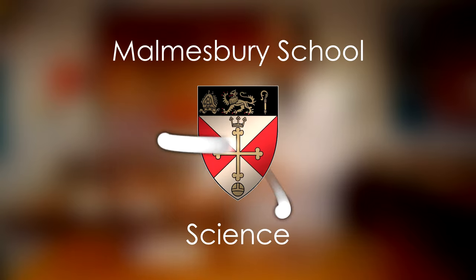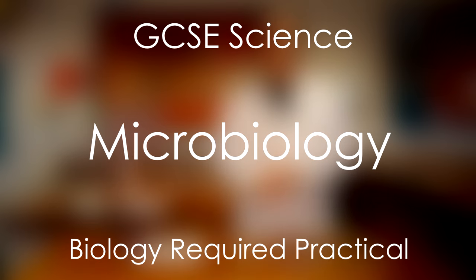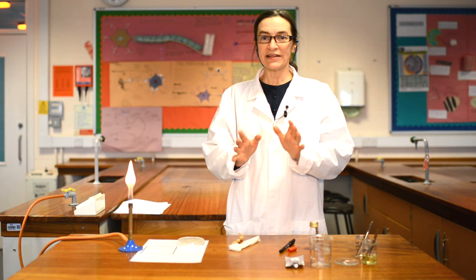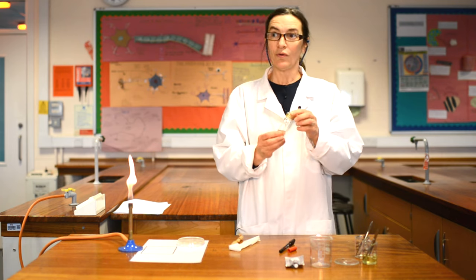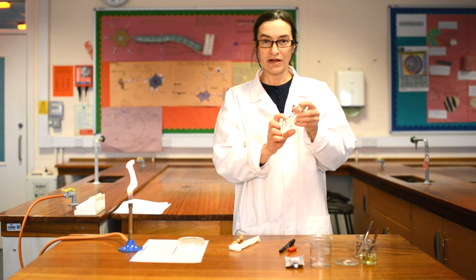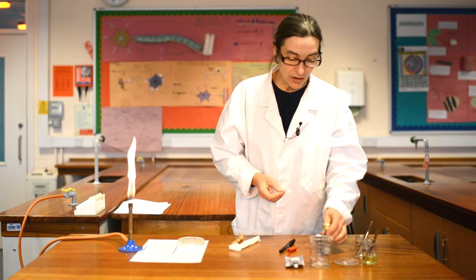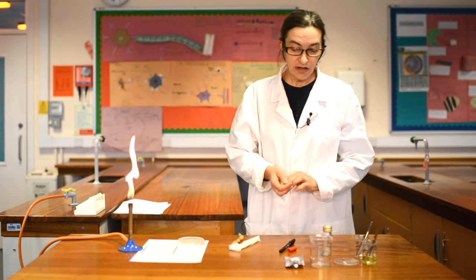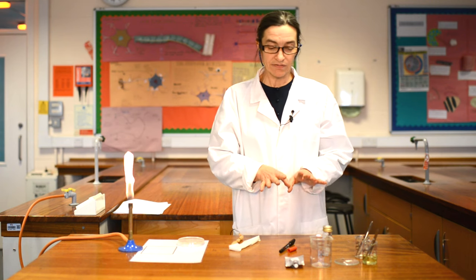I'm Dr. Beggs and I'm going to run you through the required practical for microbiology, which has found its way into the triple science biology specification. The interesting thing about this practical is that it is probably the first time either you or your teachers have worked with a real life bacteria culture. It's actually E. coli, but it's a strain of E. coli that does not cause sickness. So it's a very safe strain of E. coli.